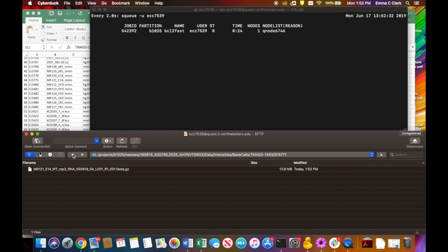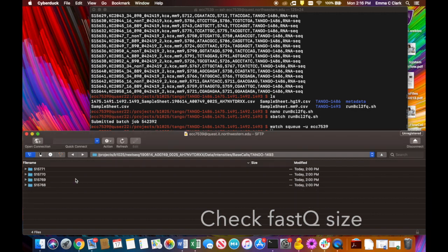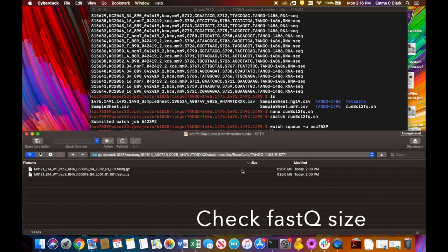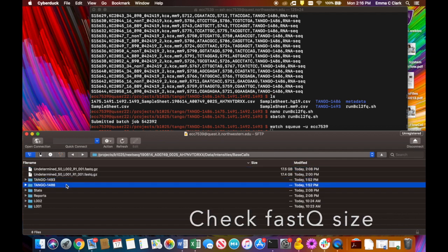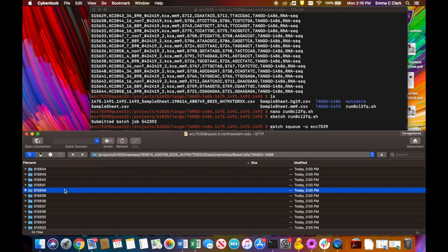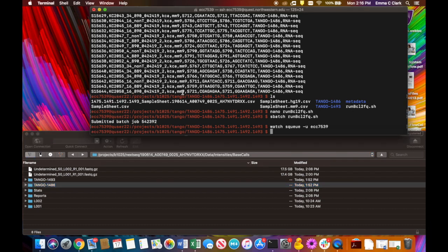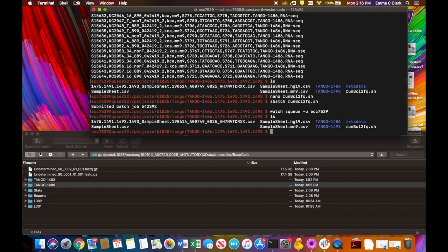So as you see, it's being generated, so we know that the reverse complement doesn't need to be done in this case because it runs just fine. So then once it's all done running, you check the actual file size, and it looks good. It's about 600 MB. And that one's about 400, 500, so that's pretty good. You just check some files, and usually they all have been generating as equally.